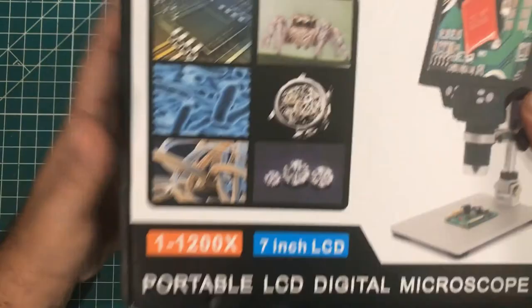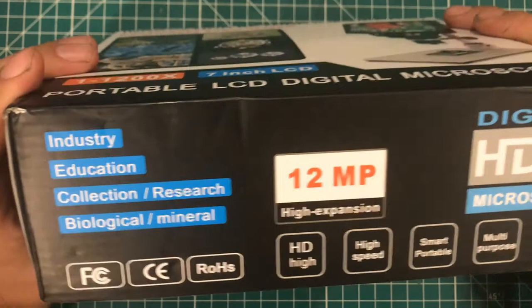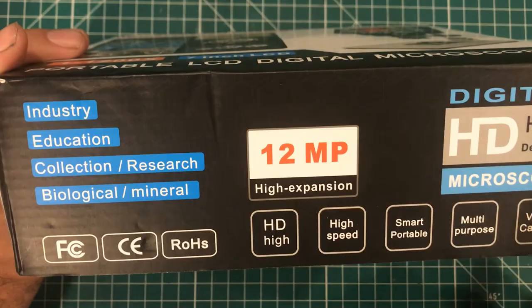This is a 1-1200X, 7-inch LCD, portable digital microscope for industry, education, collection, research, biological mineral use. It's 12 megapixels, HD high-speed, smart, portable, multi-purpose video camera. Some pictures on the side and basically the same thing on the back.